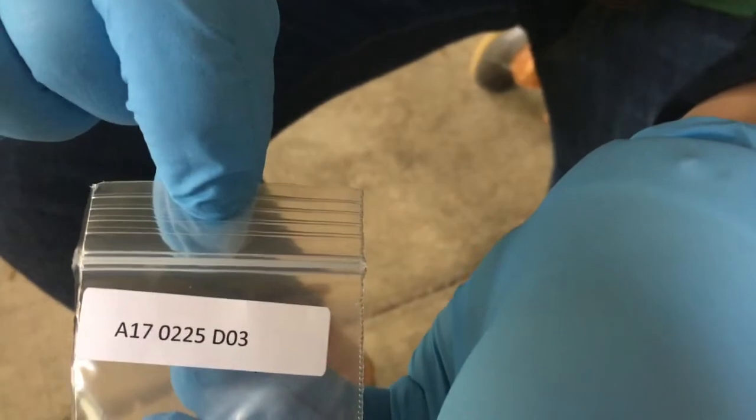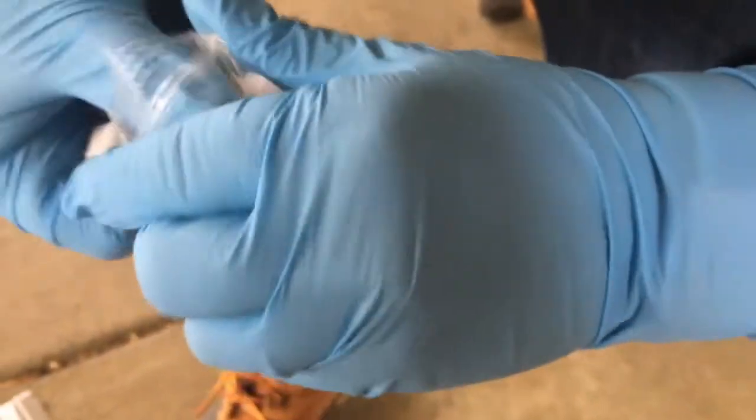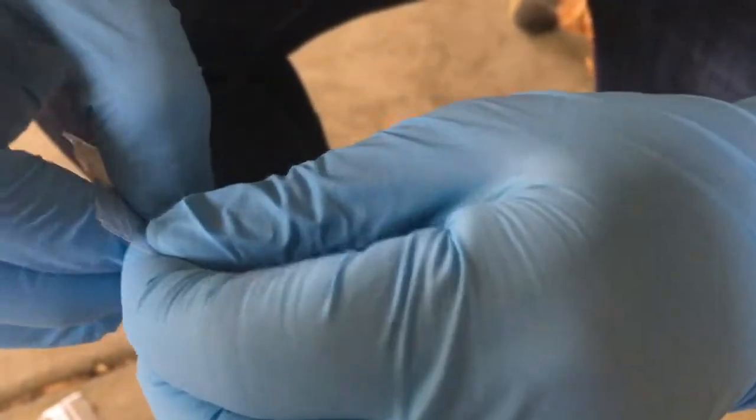Fold and place in bag with DO3 at the end of the number. Once the sample has been placed in the bag, seal the sample bag, replace it in the original sample kit, and move on to collecting your next sample.